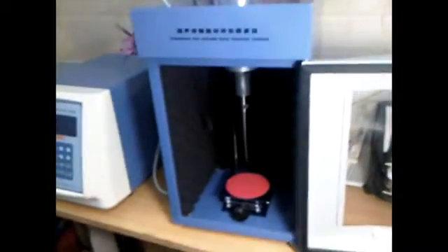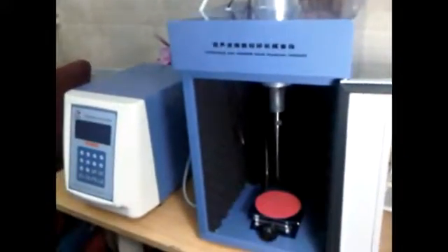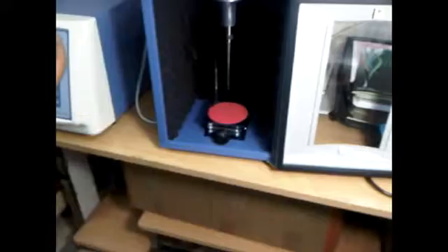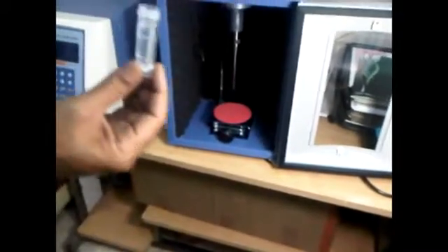But in case if you are having small sample vials, then you have to use a different assembly. Let's go and take a review of that. This is a small assembly where we can fit here.